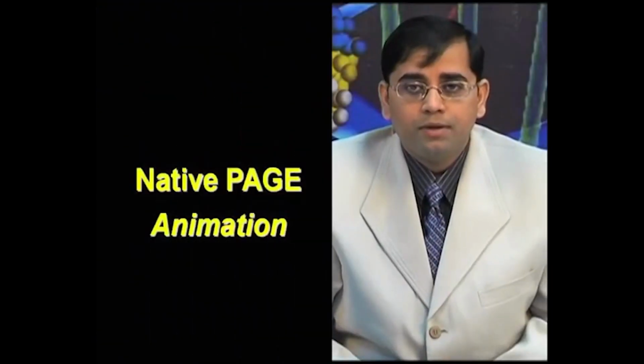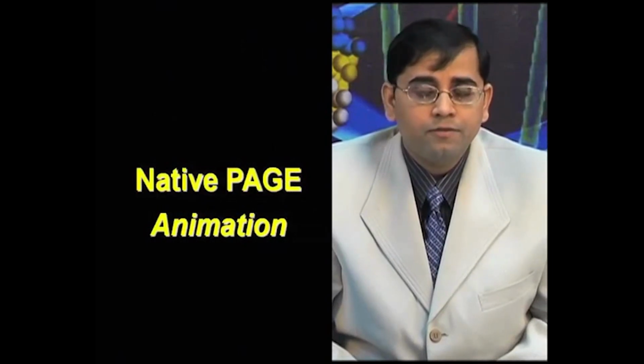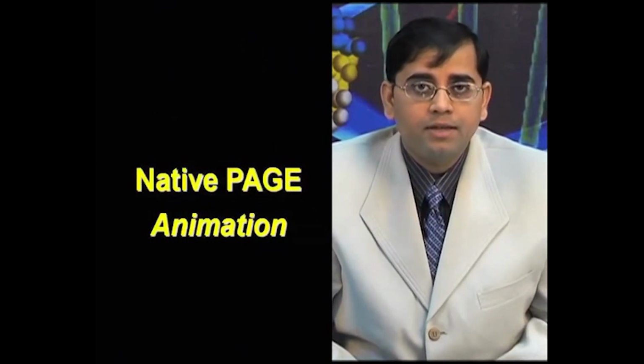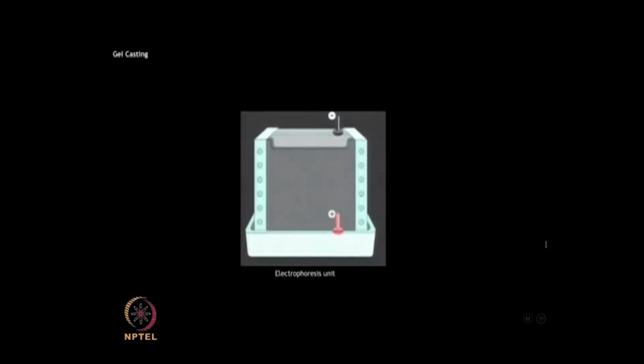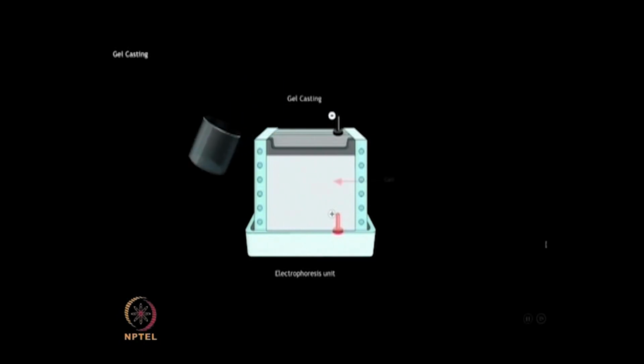I will now show you an animation of how to perform native polyacrylamide gel electrophoresis, blue native PAGE or BN PAGE. The polyacrylamide gel is cast between the glass plates as a vertical slab in the same buffer that is used for electrophoresis.